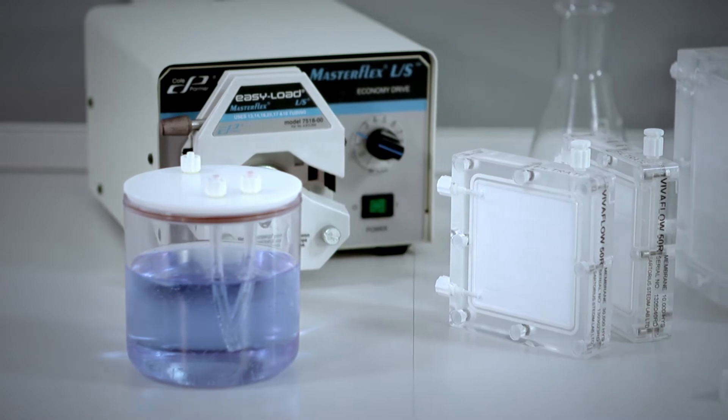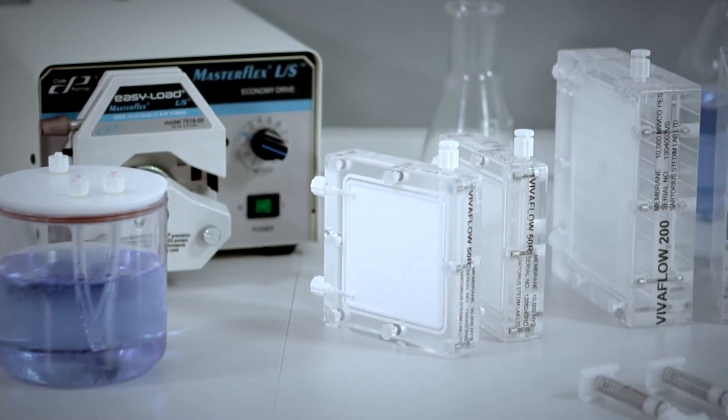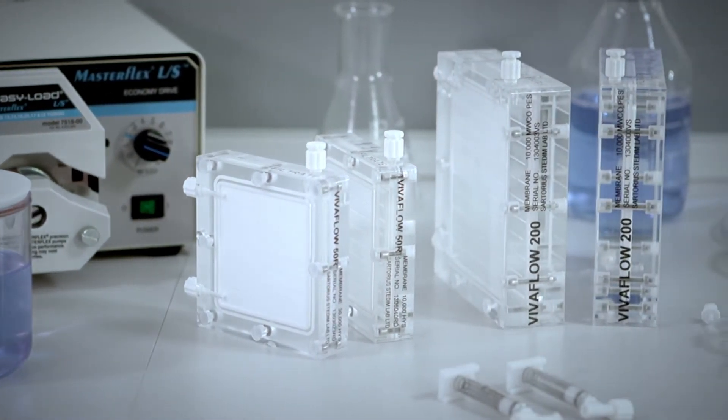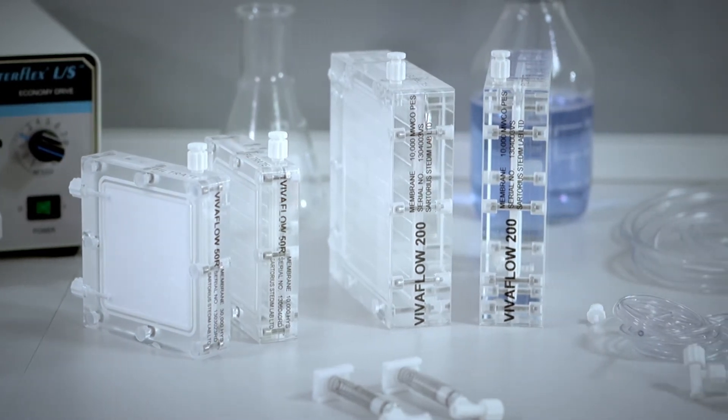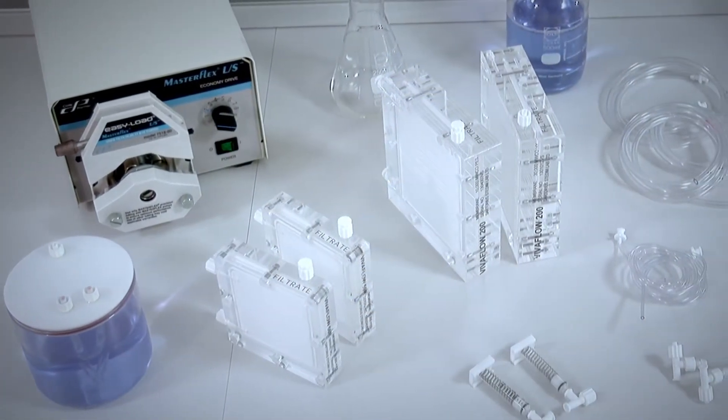VivaFlow 50R units are easy to use laboratory cross-flow devices specially designed for fast concentration of samples with initial volumes ranging from 100 milliliters up to 1 liter.